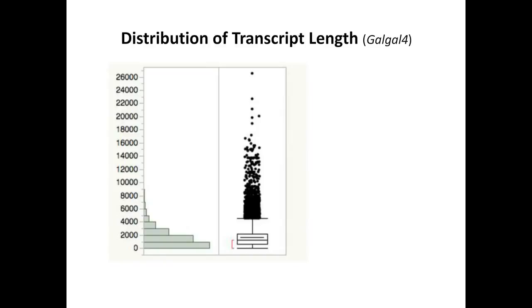So now you are comparing sequencing 100 base pairs instead of 2,000 base pairs. You can see how much saving there will be if we just focus our efforts on a small piece of the RNA. So this basically shows the difference between 3' RNA-seq and the conventional RNA-seq method.